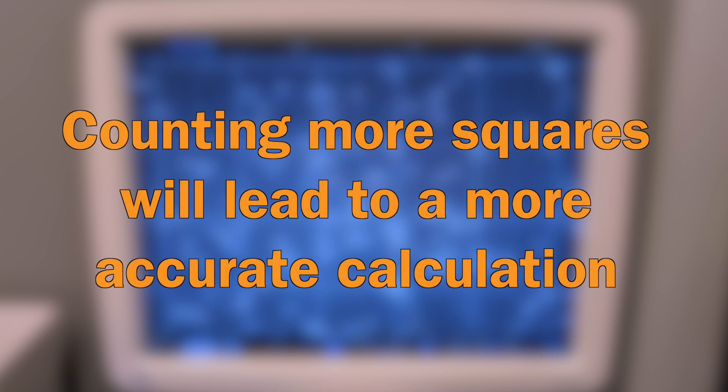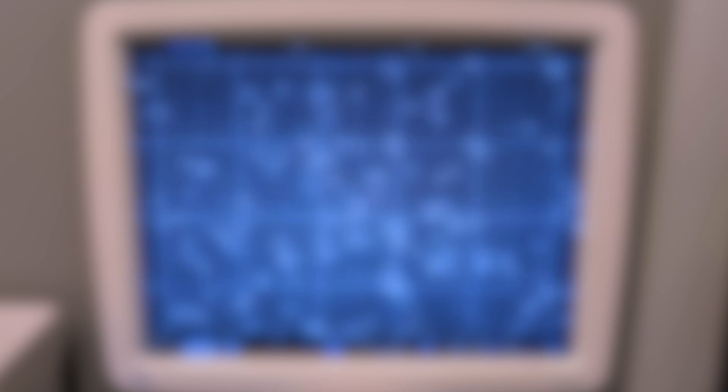In general, the more cells you count, the more accurate your calculated concentration will be.